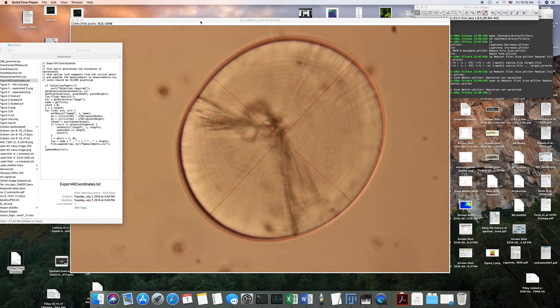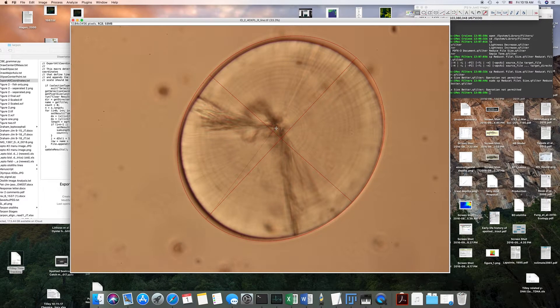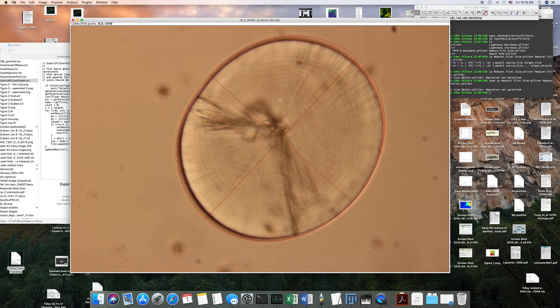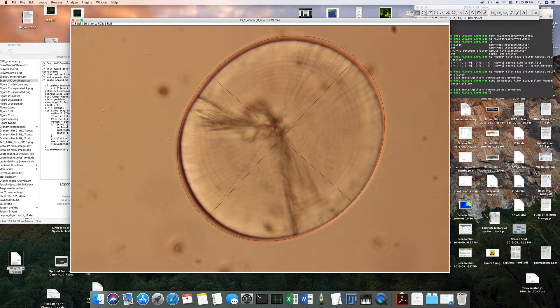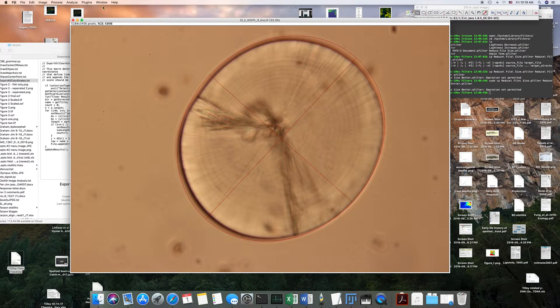All right guys, I'm going to show you how to measure the otolith increment widths using ImageJ. Once you open up ImageJ and open up an image, the first thing you'll need to do is install a macro that I made.